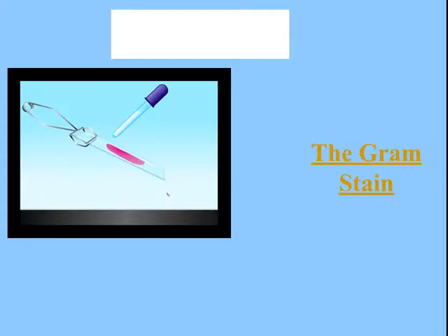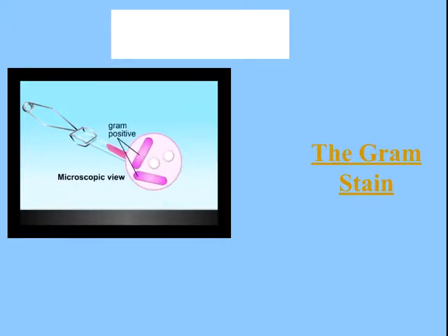Gram-positive bacteria retain the crystal violet, whereas gram-negative bacteria do not. The ethanol or acetone should be added drop-wise, with the slide tilted at an angle until the drop coming off the edge of the slide just starts to become colorless. Even gram-positive cells can lose the crystal violet iodine complex during prolonged excessive decoloration. Excess ethanol is then washed off with water.